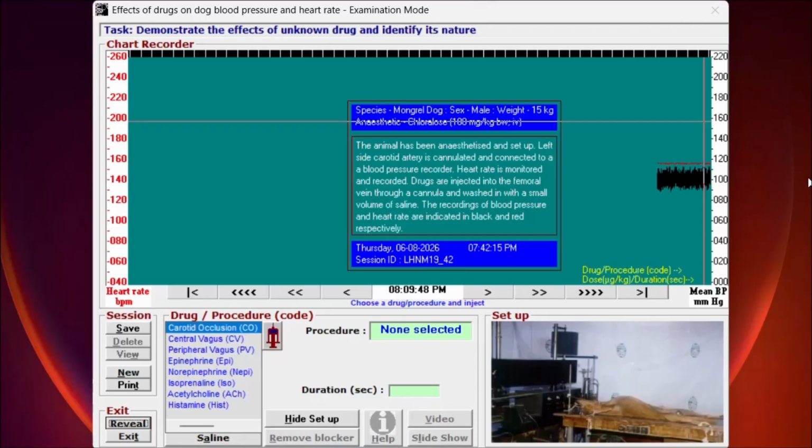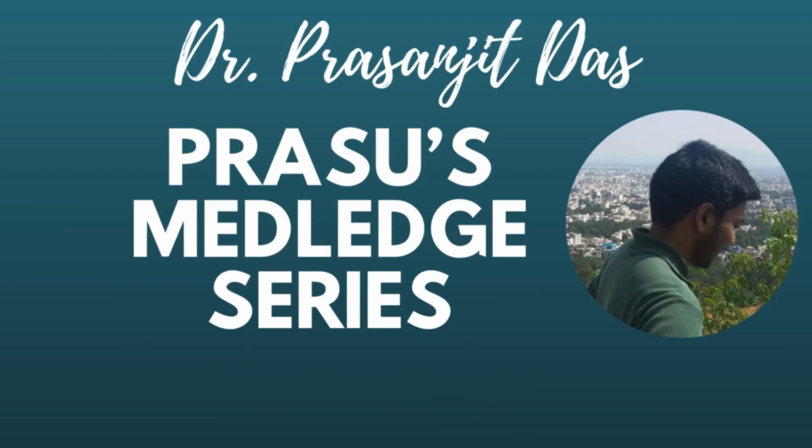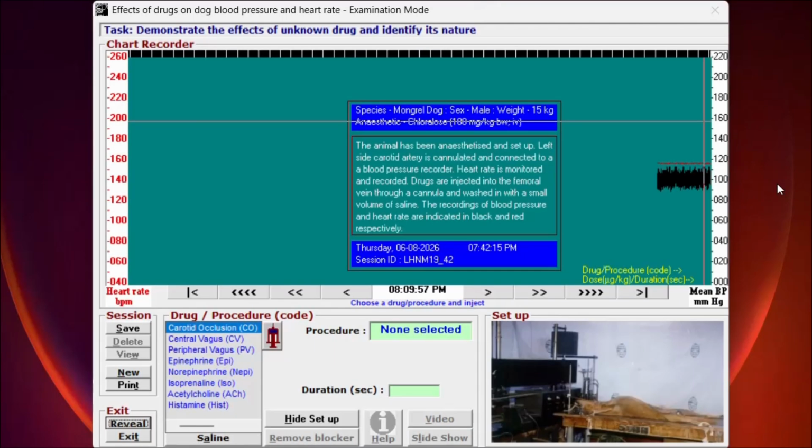So this is basically the follow-up class for the previous two classes where I have discussed the effects of drugs and interventions on dog. In this tutorial, you can see that I have opened the EPDoc software, and I am going to demonstrate how to perform those experiments in this video.